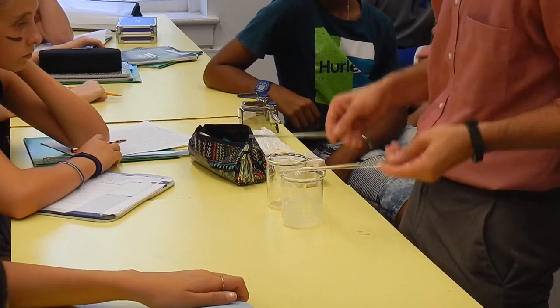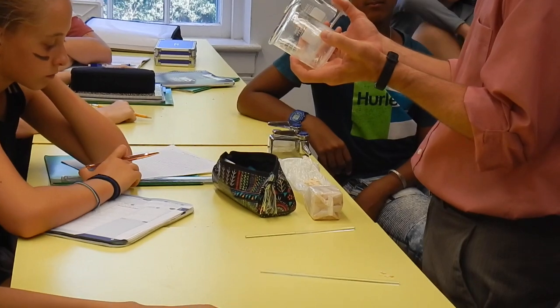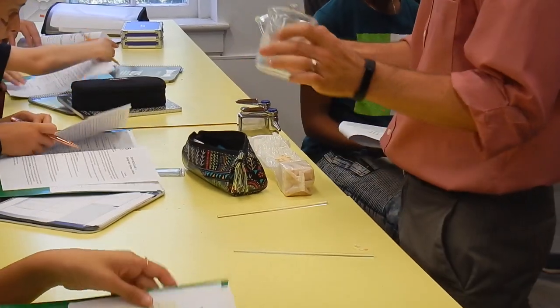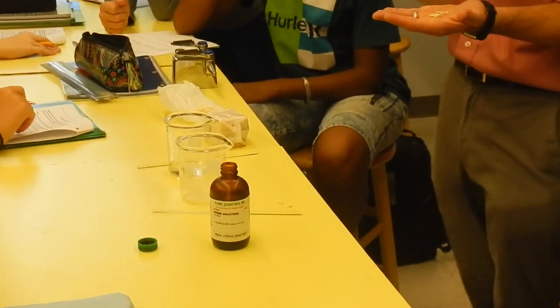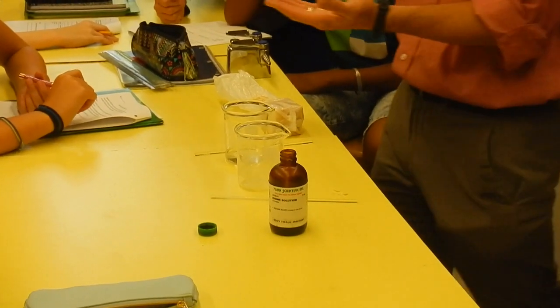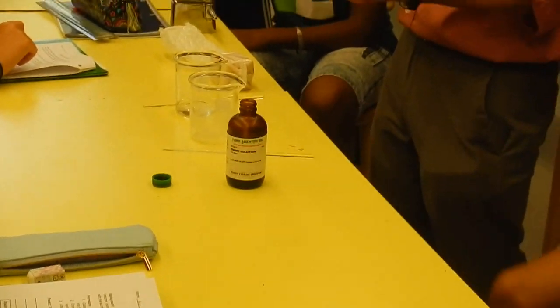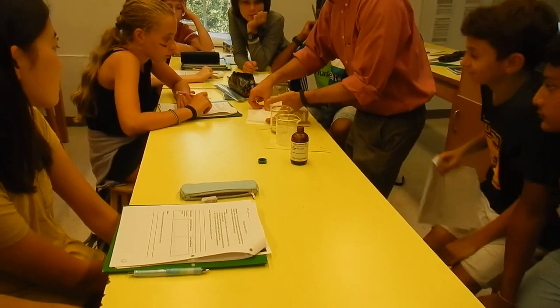and not saltines. So, what we're going to do is we're going to do a test. This test can be found on page 3, I believe, of your unit packet. In order to do this test, I need everybody's help. Starch. Carbohydrate is the macronutrient. Starch is the polymer unit of the macronutrient carbohydrate. All right, so the carbohydrate and starch, we use those words interchangeably in 8th grade, and that's okay. I need a tissue.